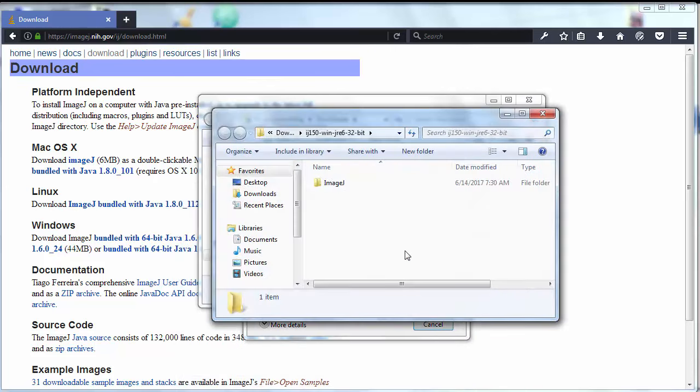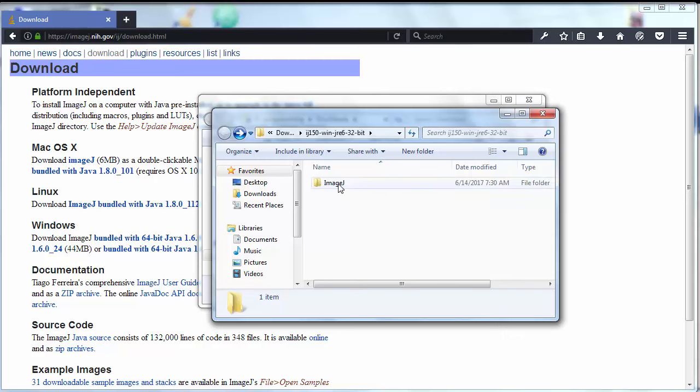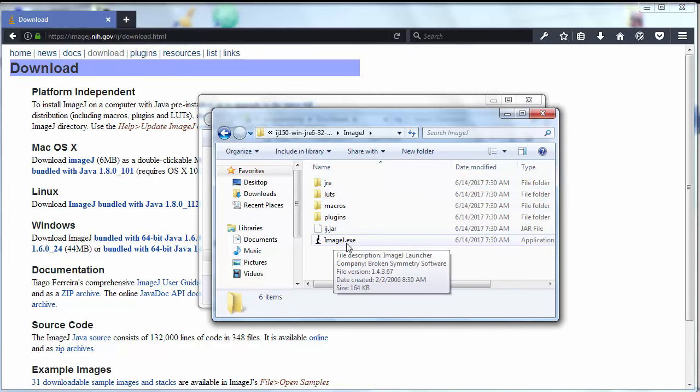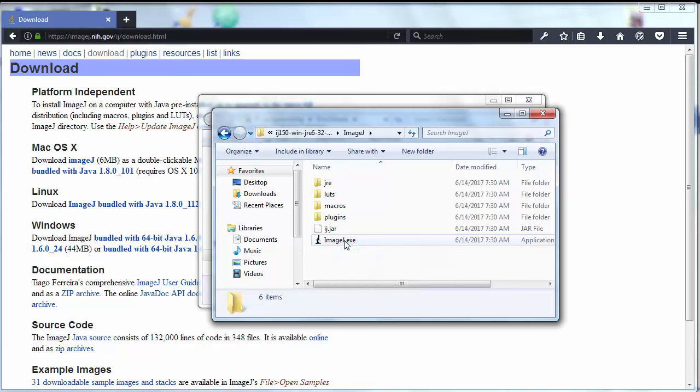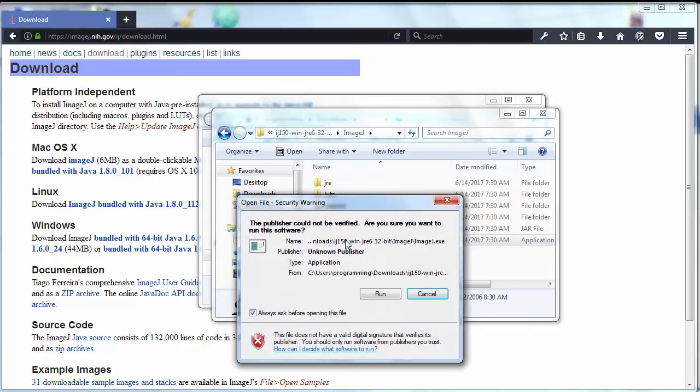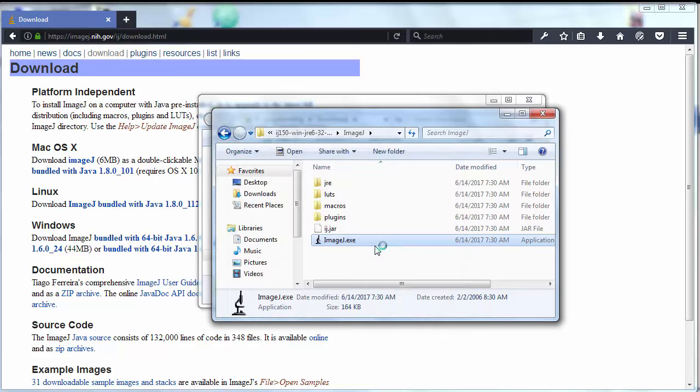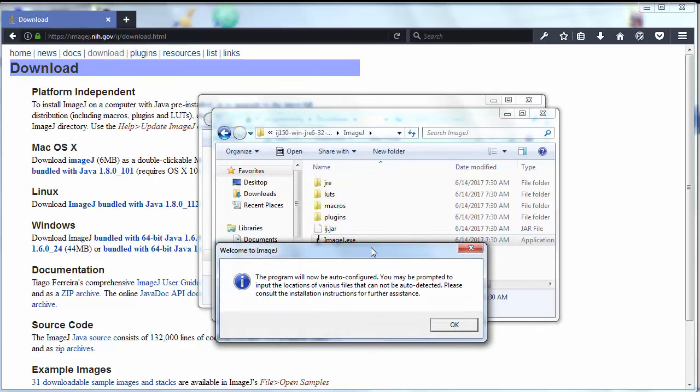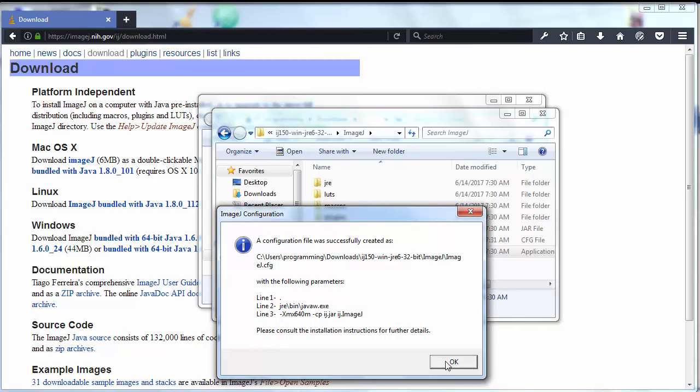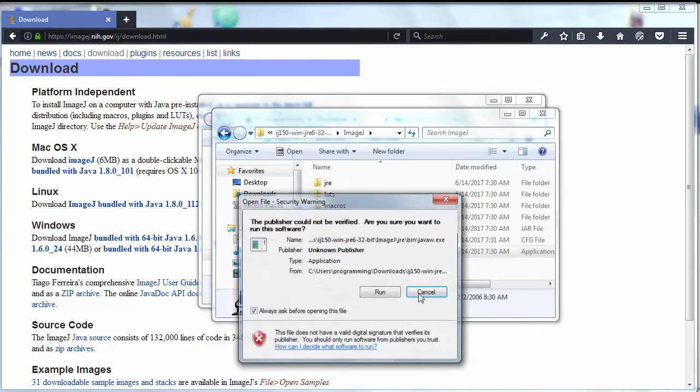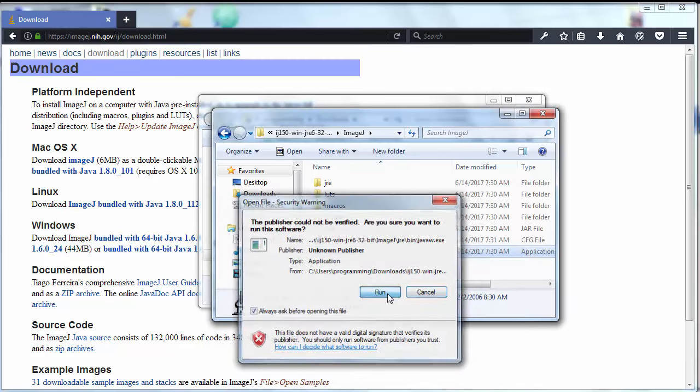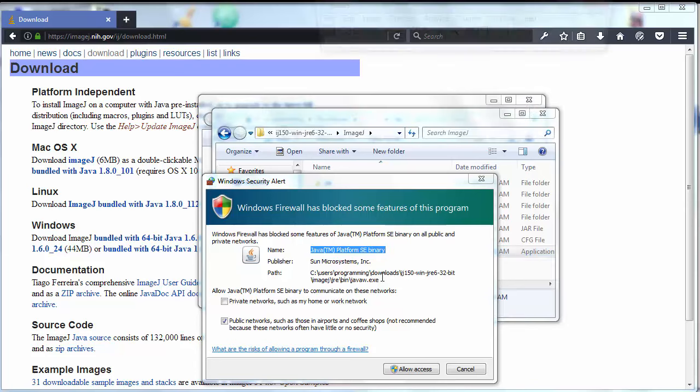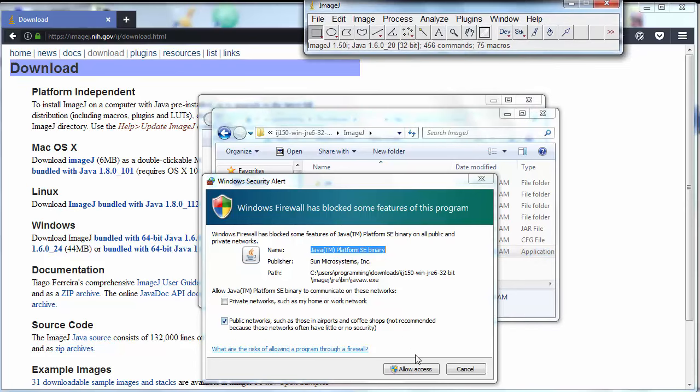Now I'm gonna open this file and click here to ImageJ.exe. I want to allow access to Java.